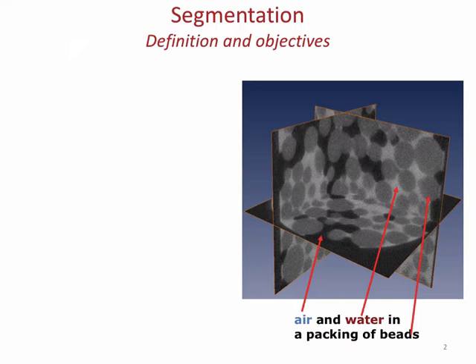Now you also have to be careful depending on the image you have. Let's say that you're dealing with microscopy. This is actually a beautifully clear image of a capillary with oil and water. Well, because of the reflection in microscopy, I'm going to have issues identifying actual phases, because all we work with in images is the grayscale values.